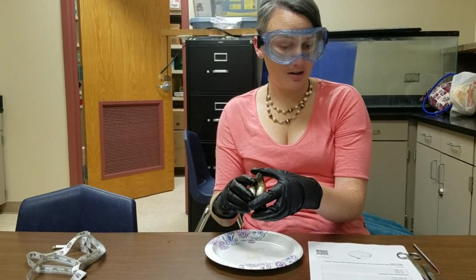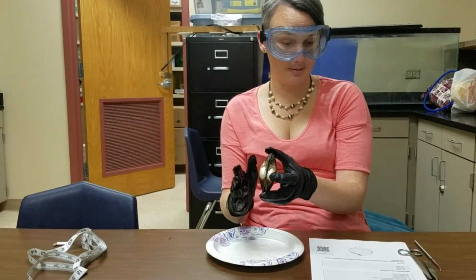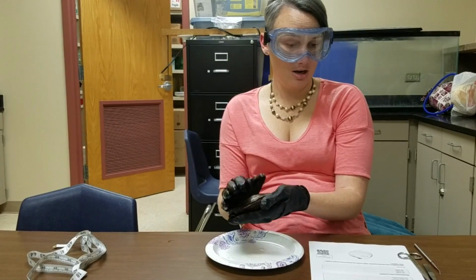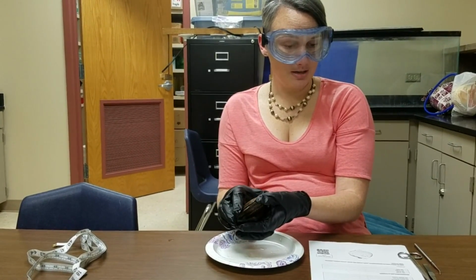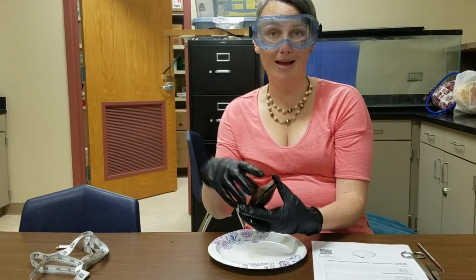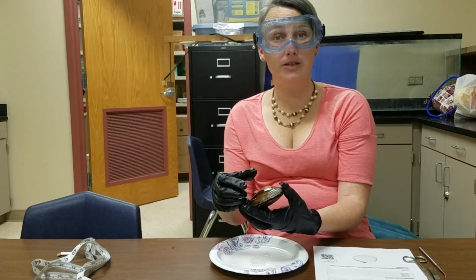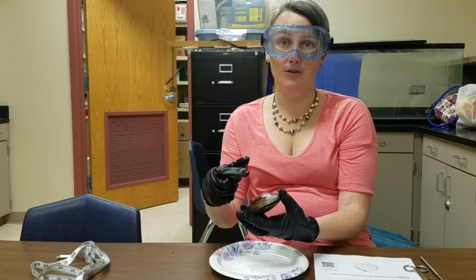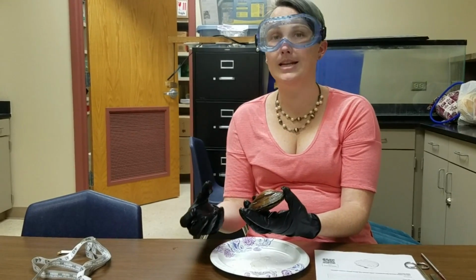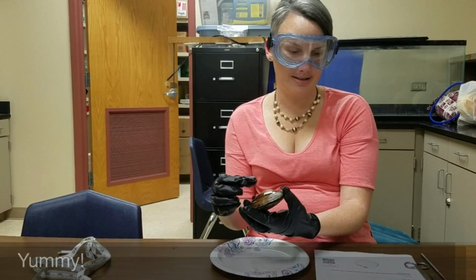Number 7, why are clams called bivalves? It's because they have these two shells, so two separate shells that are going to open and close. Number 8, what's the purpose of the visceral mass? When we open this thing up, you're going to get to see the visceral mass. It's going to be like a big blob. If you've ever eaten oysters at an oyster bake, whenever you suck everything out of the shell, in addition to the foot, you're also eating the visceral mass. It's the kind of snotty blobby part in there that has all the organs in it.